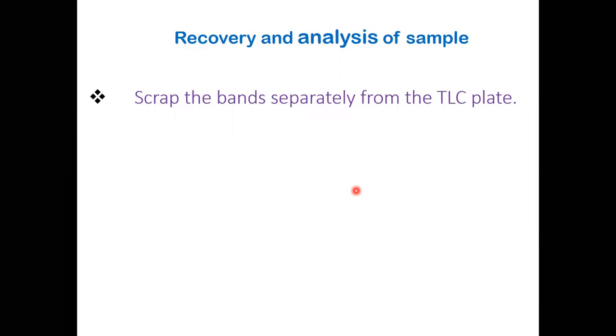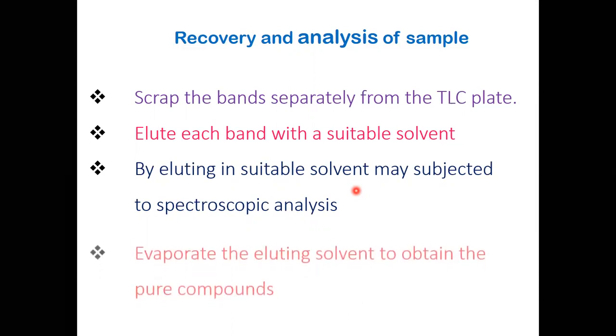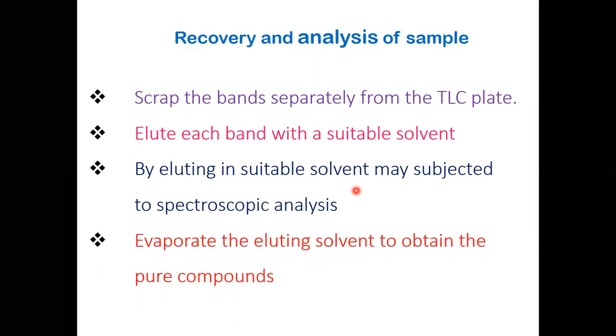After the visualization, the next part is recovery and analysis of the sample. First step, scrape the bands separately from the TLC plate. After scraping, elute each band with a suitable solvent. By eluting in a suitable solvent, we may subject it to spectroscopic analysis, or we can evaporate the eluting solvent to obtain the pure compound. Now we come to the last part, applications of TLC.